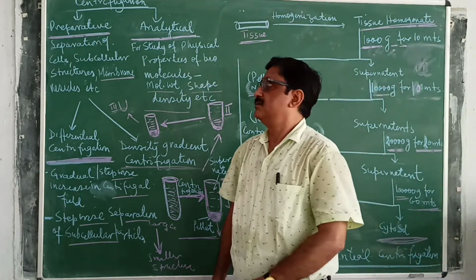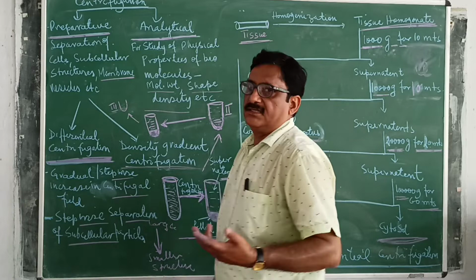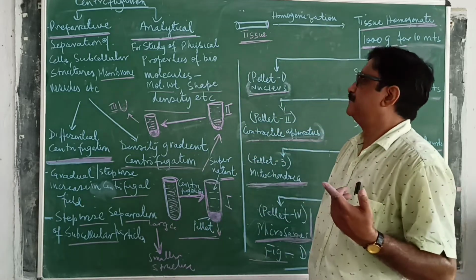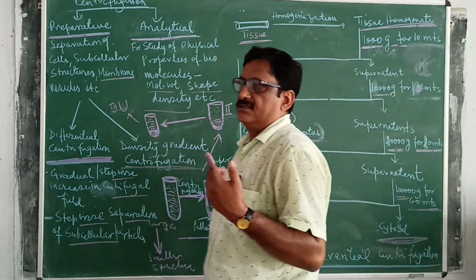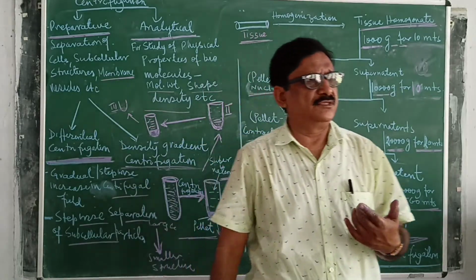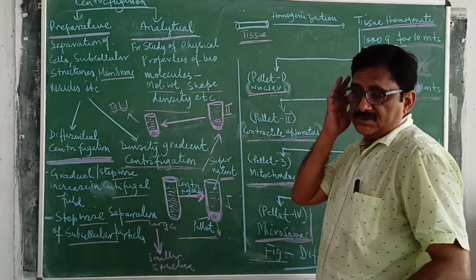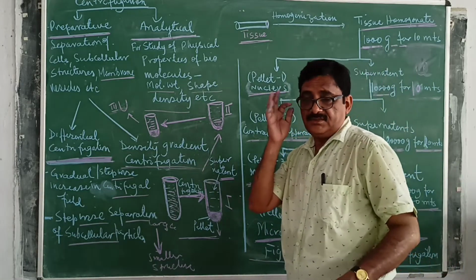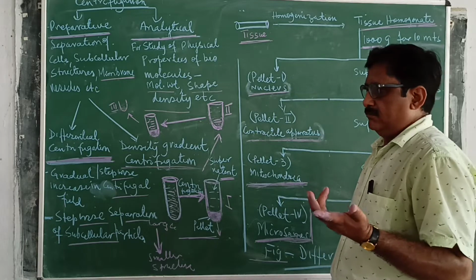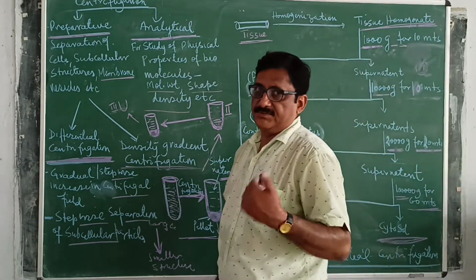Hello students, I am Amjad Fatmi, and in the last class we discussed centrifugation. What is centrifugation? What are the common terminology or factors used or applied during the technique of centrifugation?